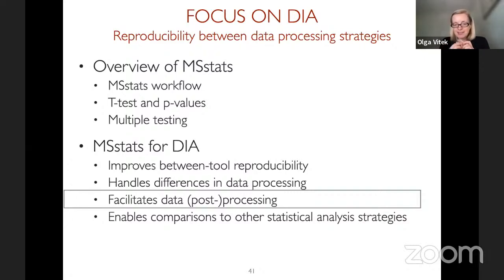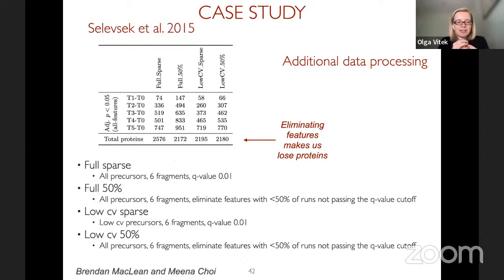So this observation, particularly with this data set, motivated another project in the lab where we asked ourselves, do we have to have these low refinement runs to understand what it means to have quality data? Or can we somehow learn what it means to have quality data computationally, without having to do additional experimentation? And so this is now the next step for that.